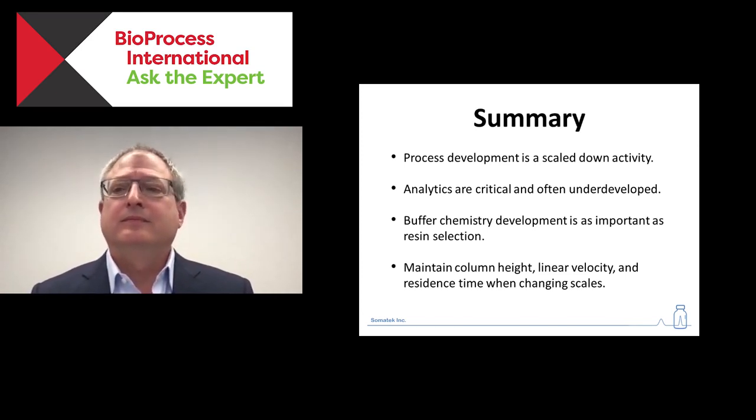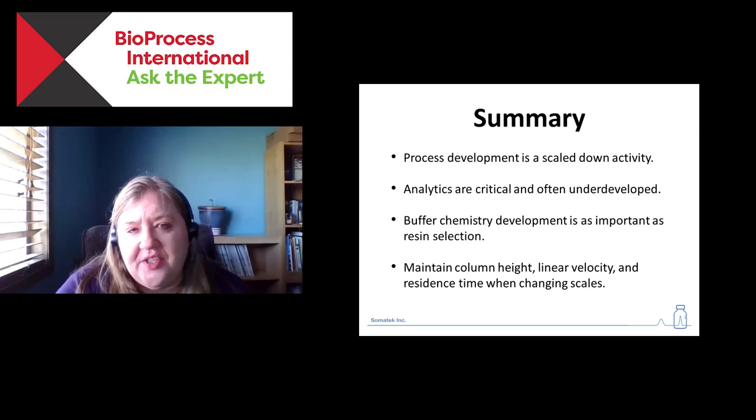Okay, great. Thanks. So the first question is, you described the development of a process for a retrovirus-like particle. We are using an AAV vector. Would your process transfer to AAV?